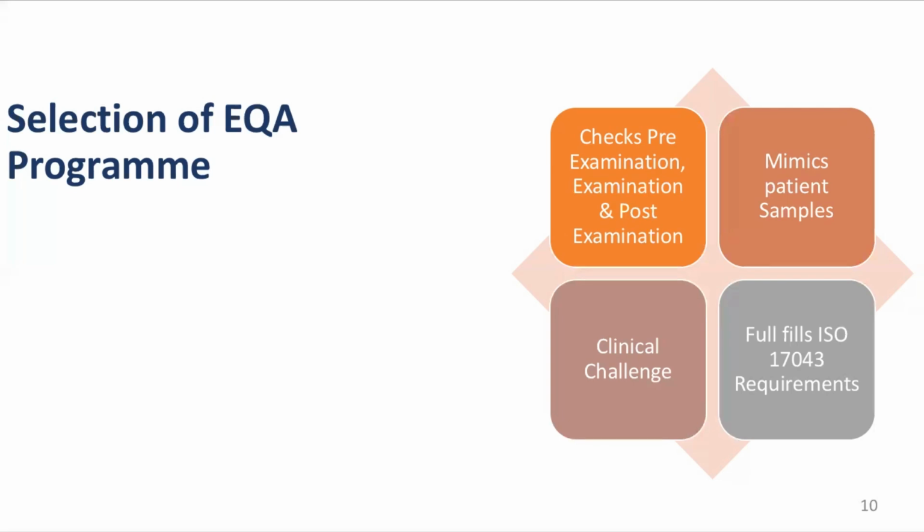And whatever EQAS sample you are using, it should mimic a patient sample, and have some clinical challenge. Whatever the diagnosis, it should impose some challenge to the laboratory, or the quantity to test should be in the borderline range.